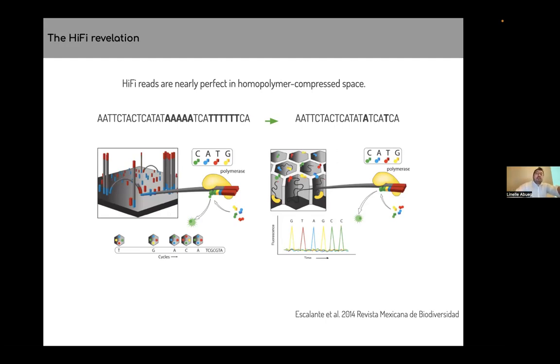That's a big problem for PacBio. So to assess quality, they just don't consider these homopolymers. For instance here, that's how they consider the almost perfect reads: this series of 5 A's represents 1 A, and then you get a perfect read. So there are some errors, but again, these errors are random. So with assembly consensus, you can reach a very accurate answer.